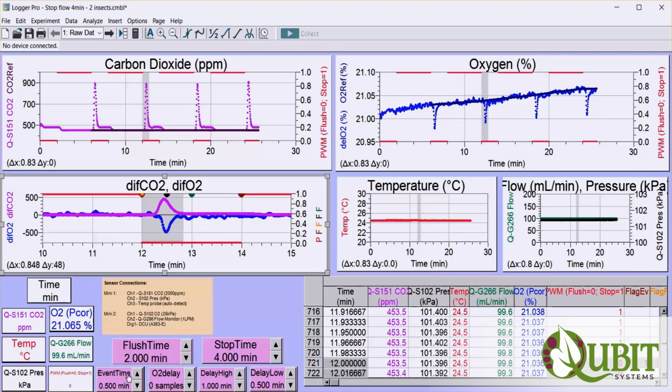These user parameters do not have to be set up at the beginning of the experiment. They can be set up when the data is already collected. However, after you run this test experiment here, we have enough information to get these parameters fairly close to where they should be. So I'm going to explain how to do this.